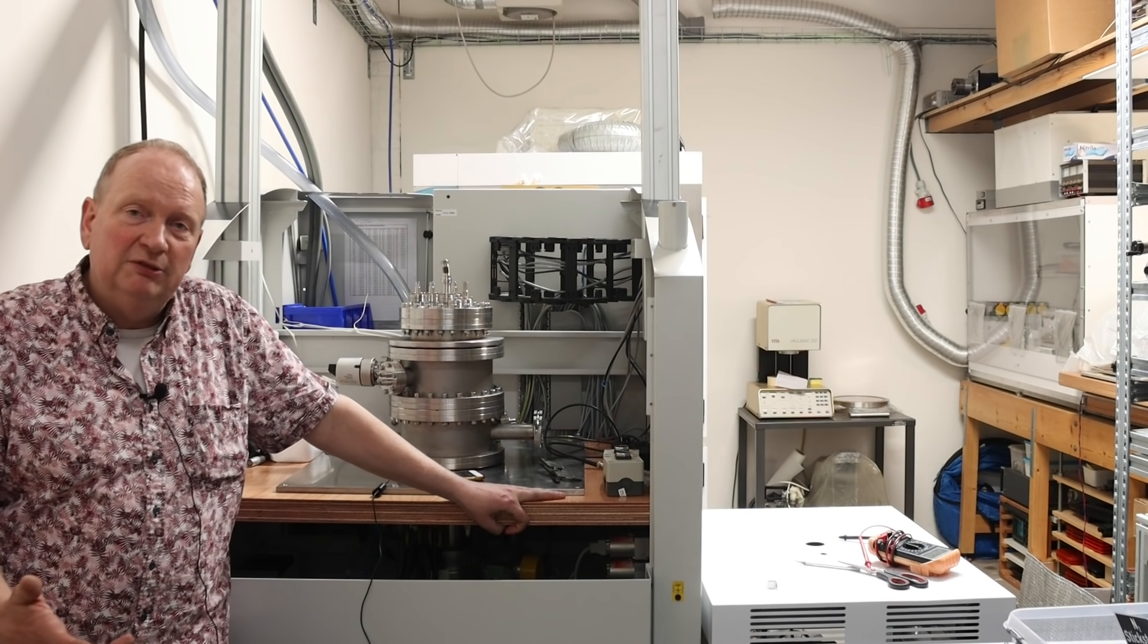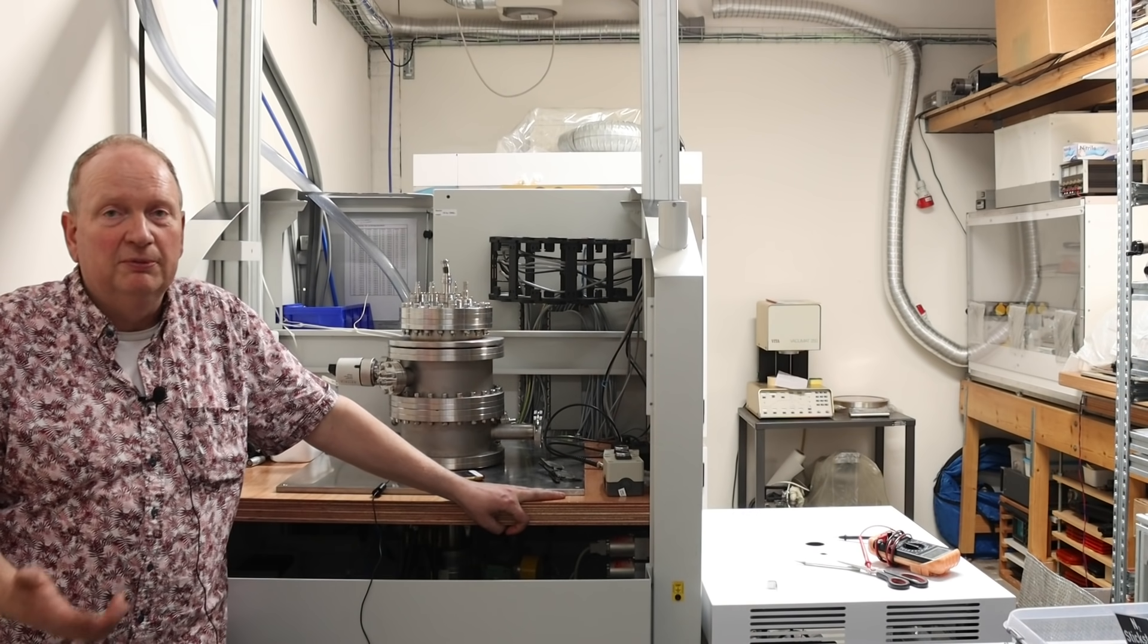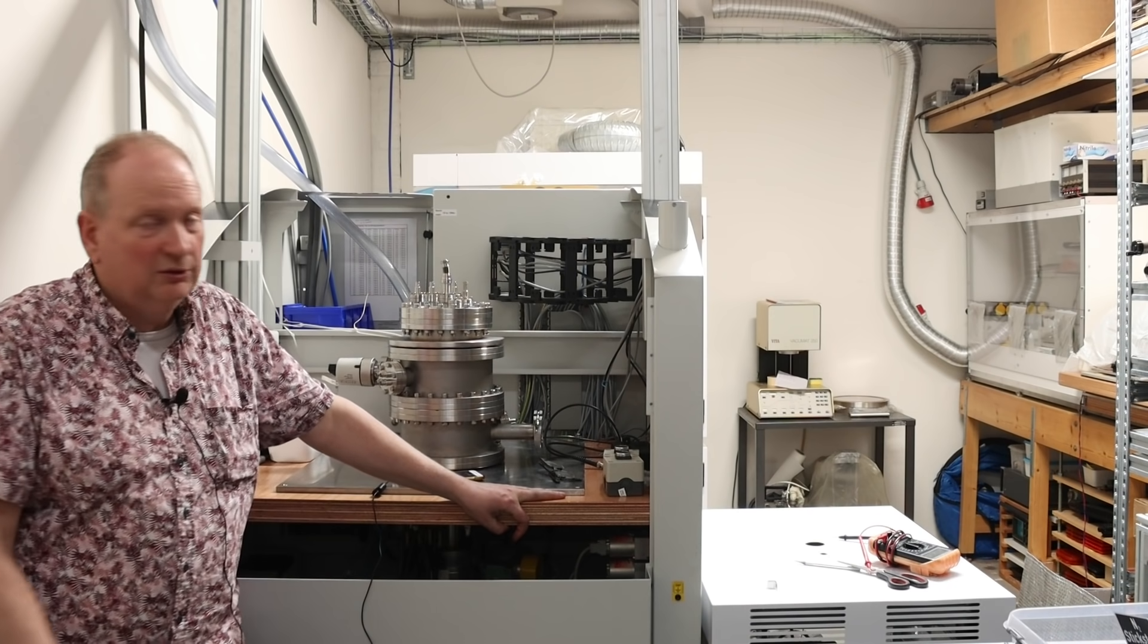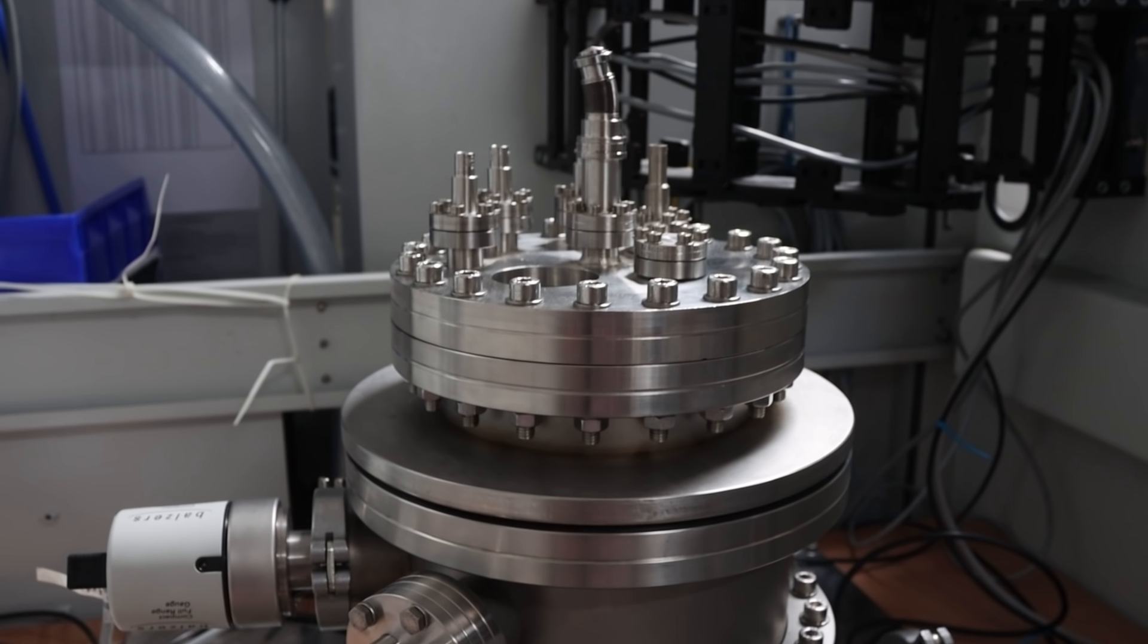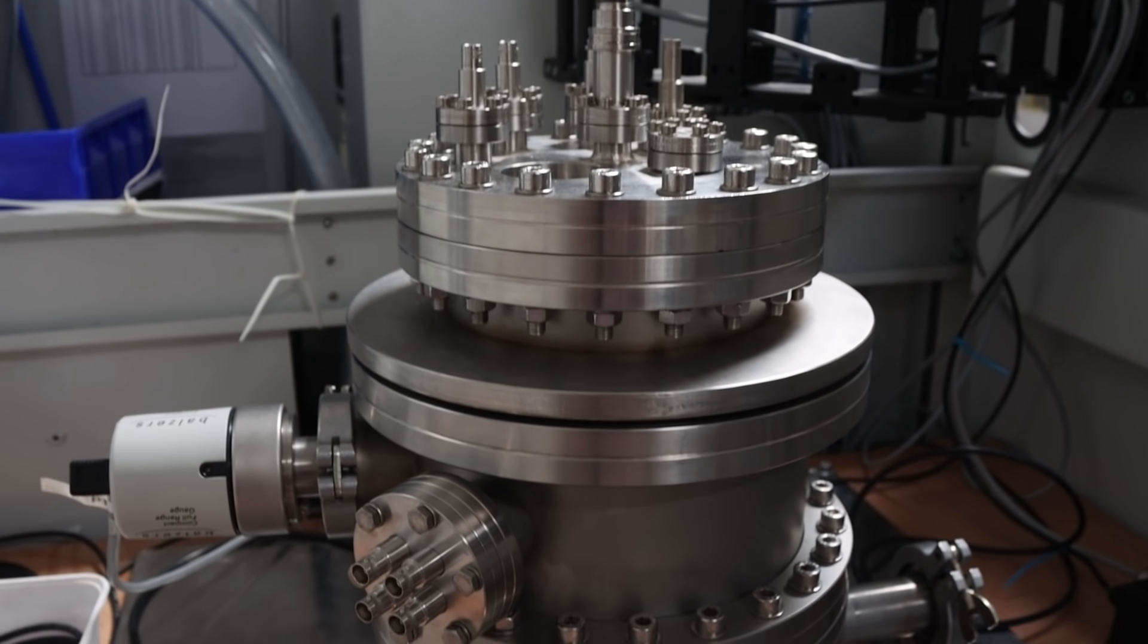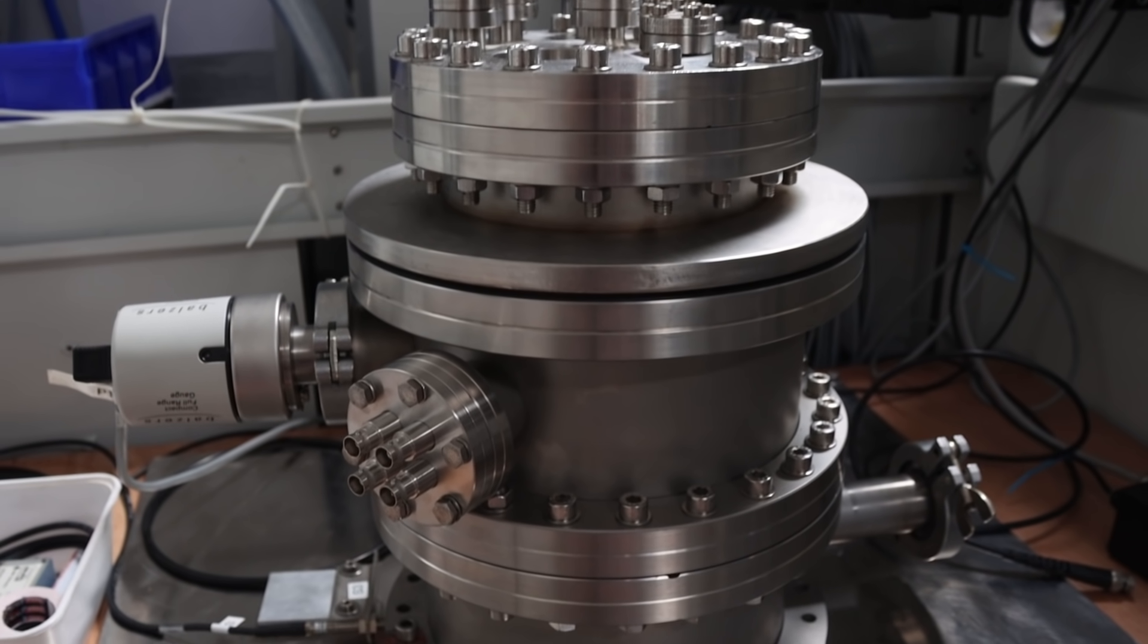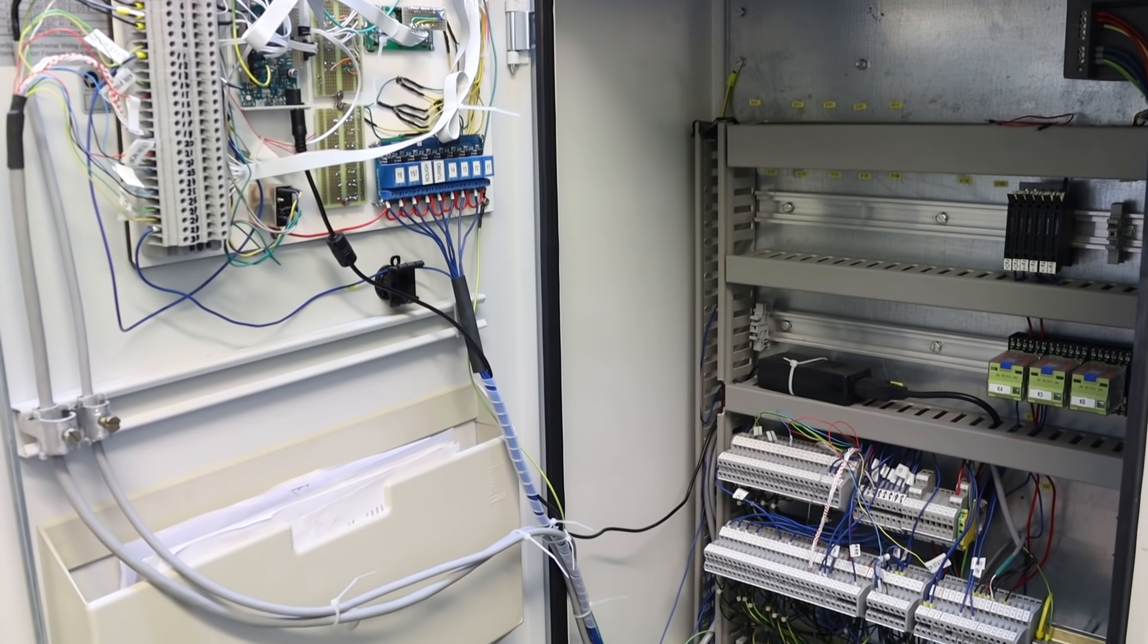It is not completely finished, it is actually sort of a work in progress, so I will build new aspects to it in the future. As I said, it took me a few months so far to build this, so it is actually quite an elaborate project.